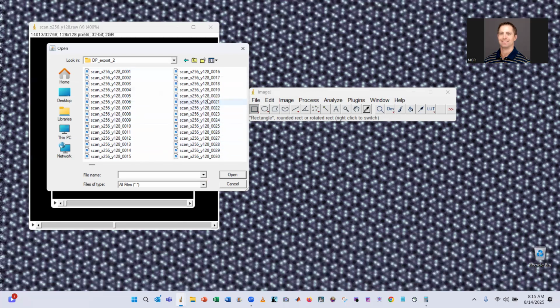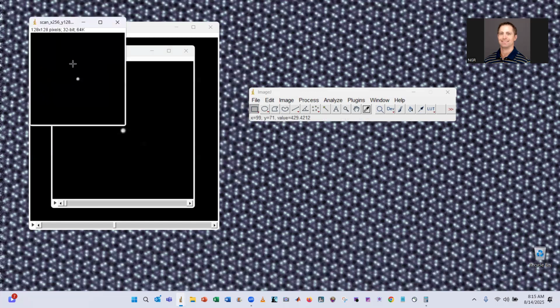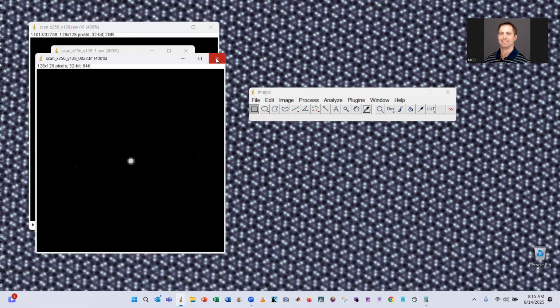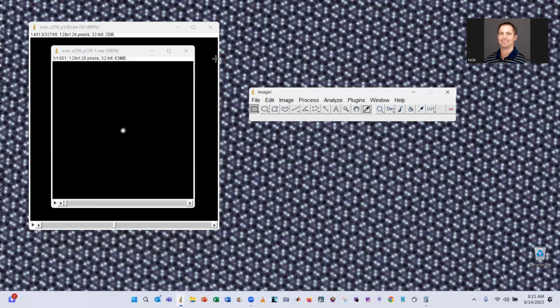But let's just go ahead. Let's open one of these here. Okay. Yep. And it opens up fine. Everything looks good. And then you have your sequence of TIFF versions of your diffraction patterns, and then you can use those to reconstruct your data.